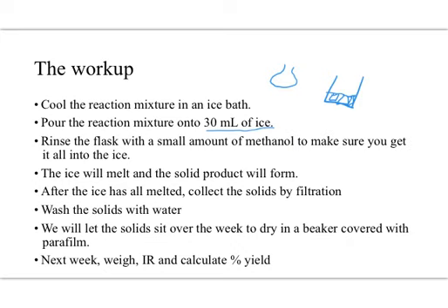Any H minus that's left around, any O minuses that are left around from the camphor reacting are going to be quenched when we add water, and we'll wind up with a hydroxide solution. And it'll be pretty dilute with all this water that we're going to have present there. All right. So once all the ice melts, we should get a solid as our product. Right? And after all the ice melts, you can then collect the solids by filtration.